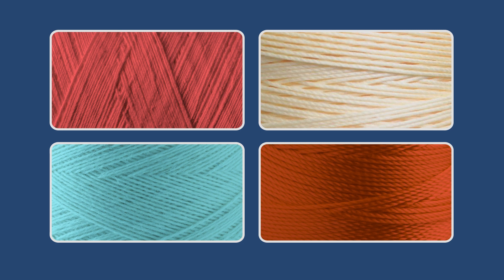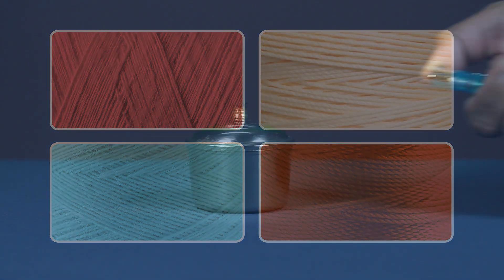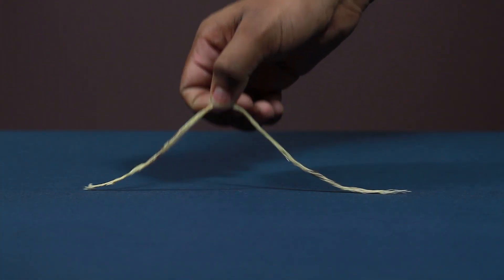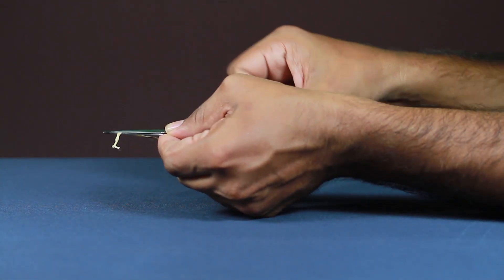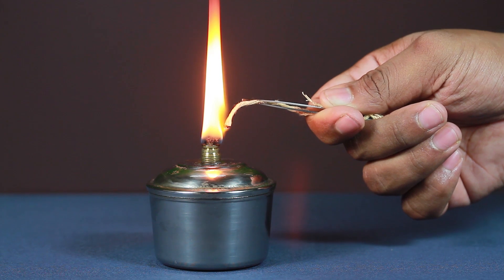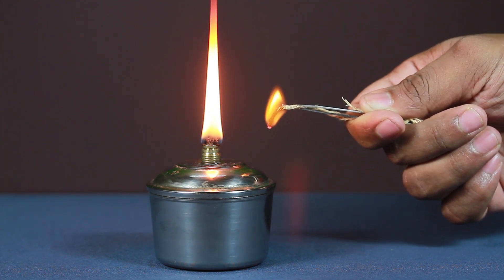Procedure: collect different samples of both natural and man-made fibers. Light the spirit lamp. Take a sample thread, say wool, and hold it with the forceps. Burn it in the flame of a heating device and observe.